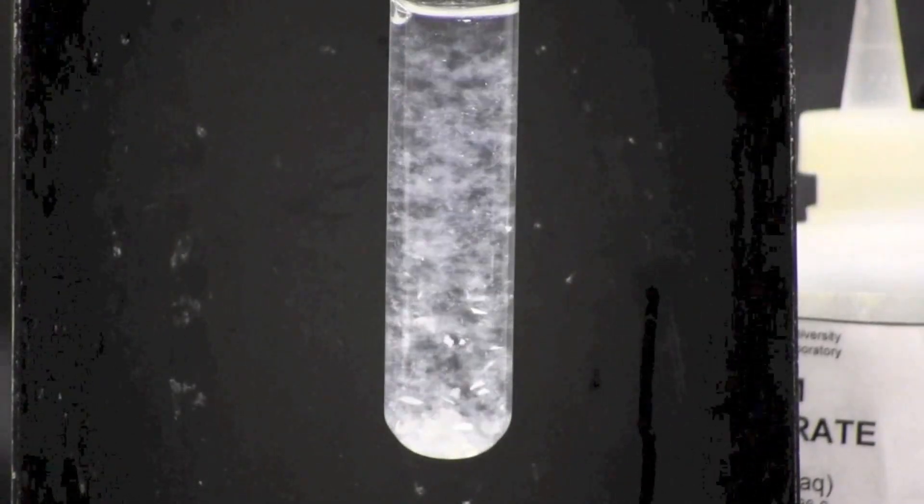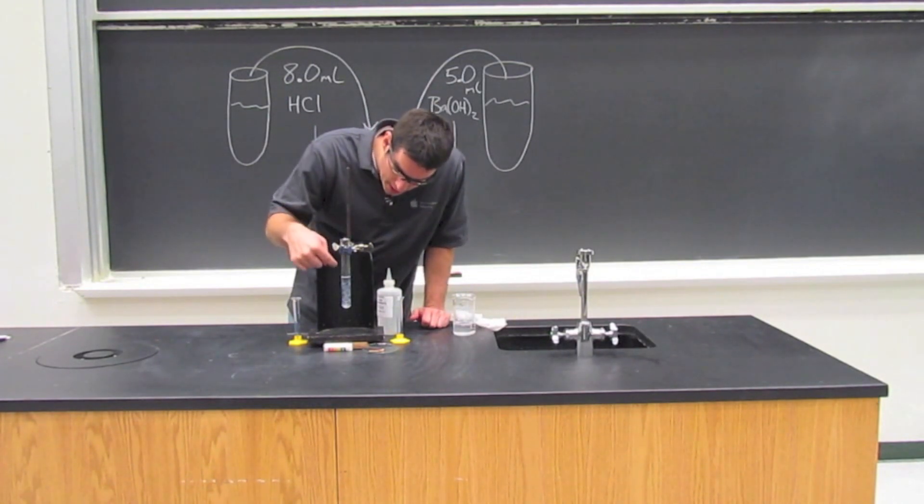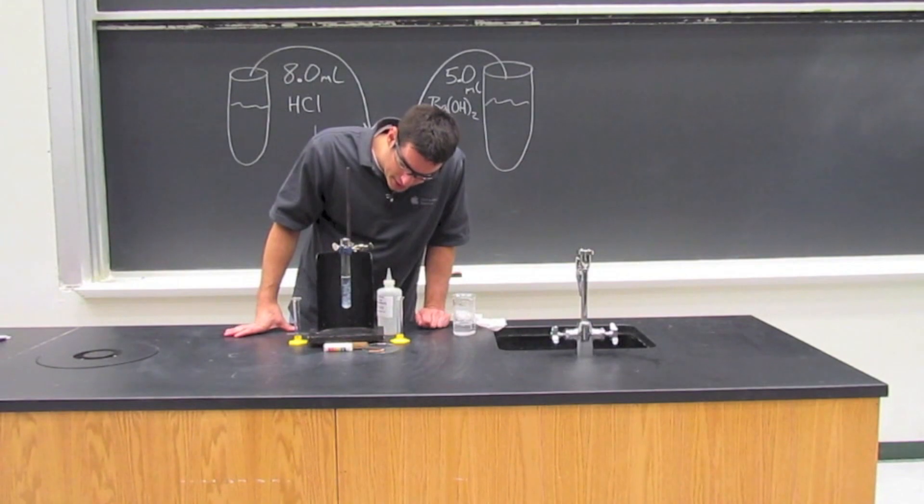We're going to let this reaction finish and then let the precipitate settle down to the bottom of the test tube.